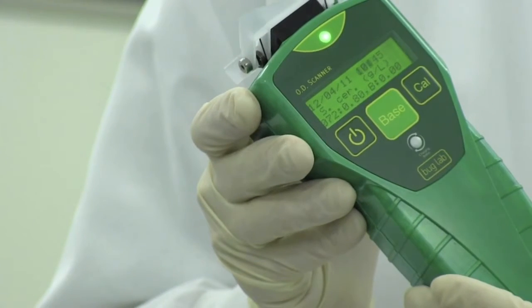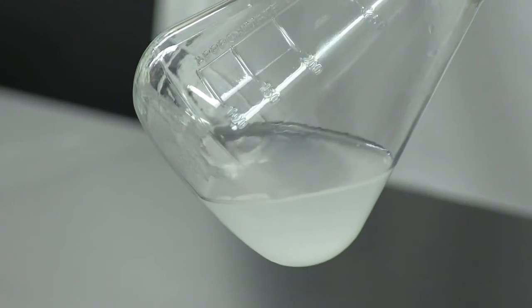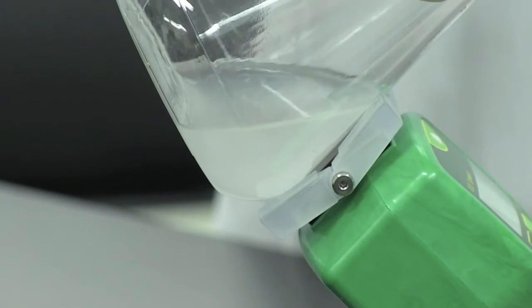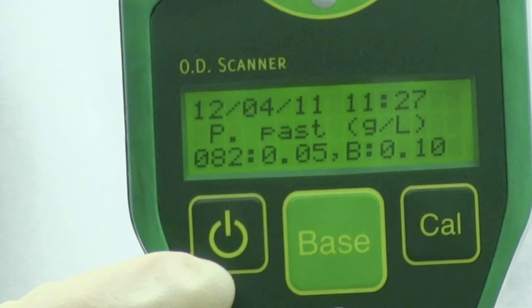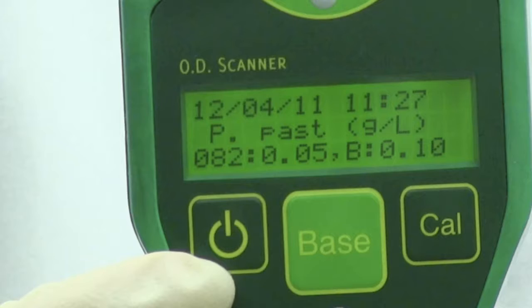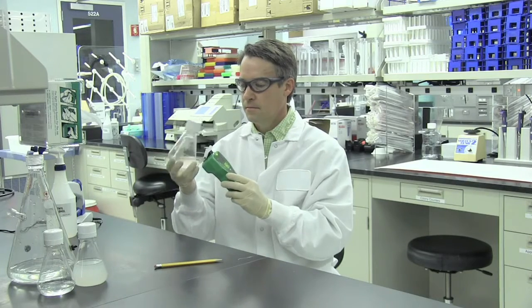We recommend using the baseline feature when working with complex media that appear cloudy or contain particulate matter. In such cases, take a measurement of the flask containing only media, for example, prior to inoculation. We also recommend using the baseline feature for larger flasks with thicker walls. In some cases, the reflectance from the glass wall itself may be large enough to affect the measured signal. Setting a baseline correction will be sufficient to make your biomass results consistent across most flask sizes and shapes.